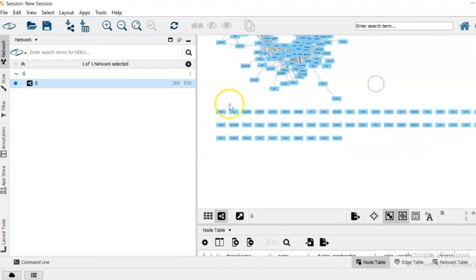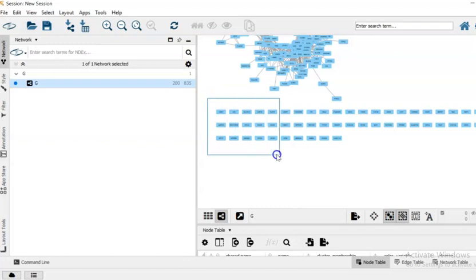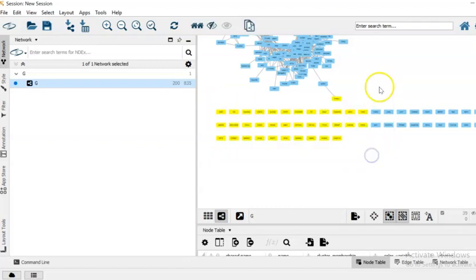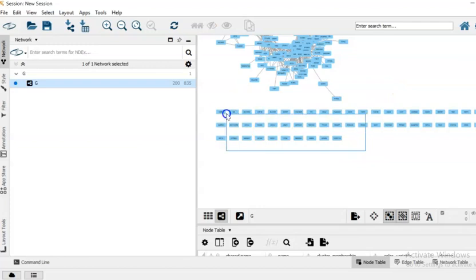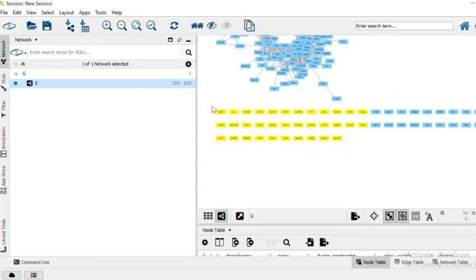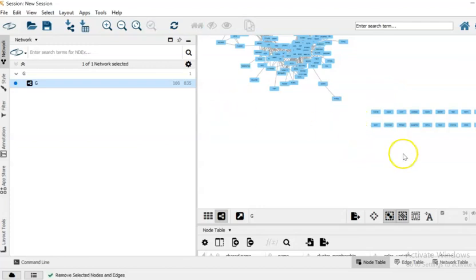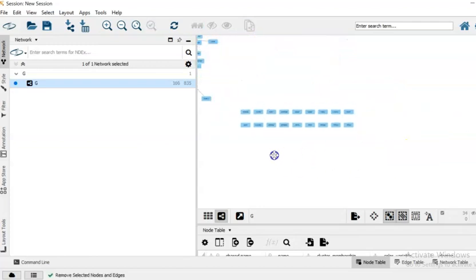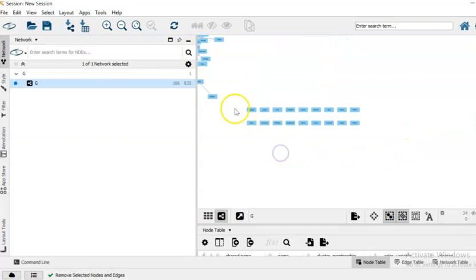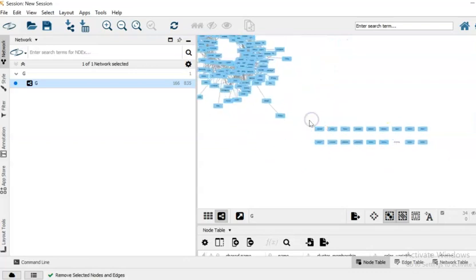So you need to press control and then to select the nodes that you would like to remove, and then just remove them.